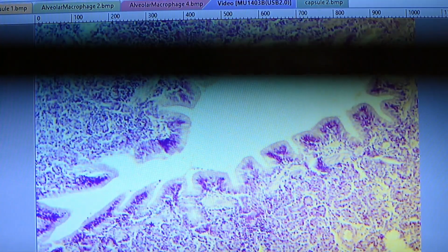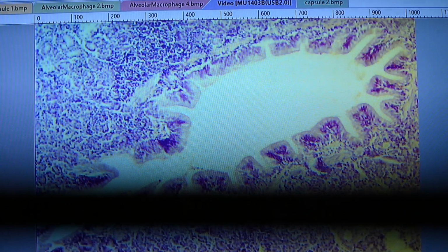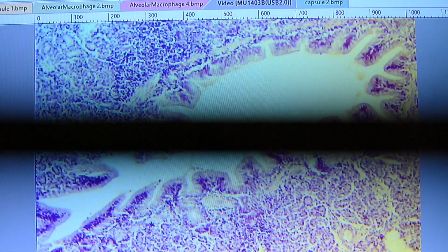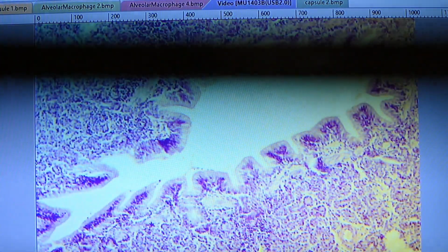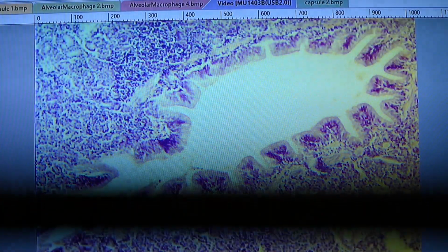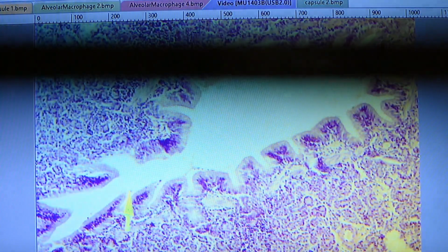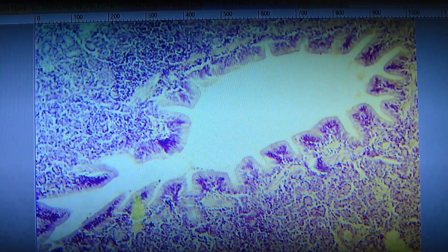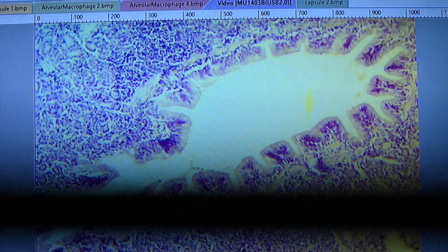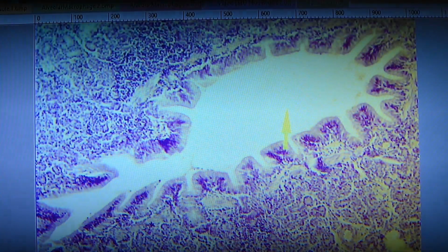All right, this is a pretty good view here. We don't see any cartilage on the screen, so we're kind of down at the lower end of any bronchus and entering into a bronchiole. So as we go off that space heading off onto the left side of the screen over here, this would be leading into a smaller bronchiole over this direction. This would be like the last part of a bronchus, or very beginning of a bronchiole over here.